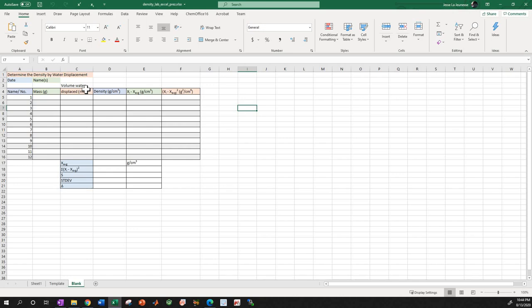It's going to be different from what you see in my video, but the functions and instructions are all the same. And again, any little thing you need to do that I don't show you, you can Google it. You can go on YouTube, and so many people have put out thousands of videos of how to do some simple thing. In fact, when I was setting up this video, I learned how to do something in Excel I didn't know how to do before, and I've been using it for almost 7 years.